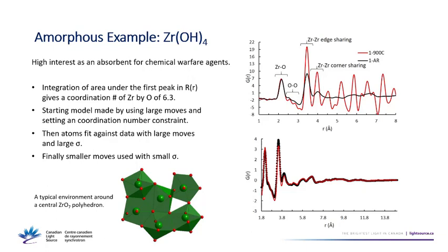Any more questions for Graham? Yes. I just have a general question. This is just a PDF question: does the temperature of the sample affect the widths of your peaks? Like if you had it at cryogenic temperatures, would you have much narrower peaks than if it was really hot? Yes. Okay. Is that desirable in any way? Do you have to know what the temperature is specifically, or does it not really affect it as much?